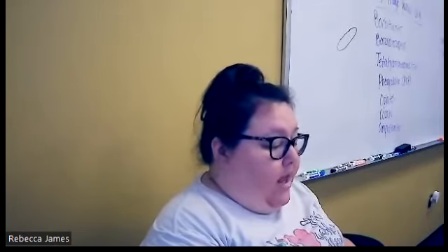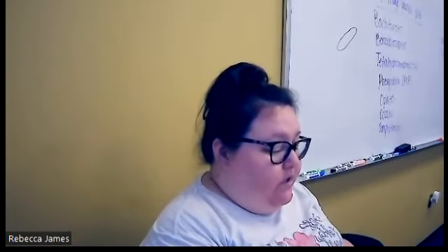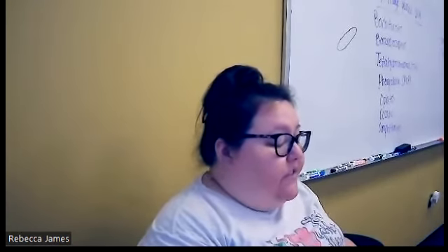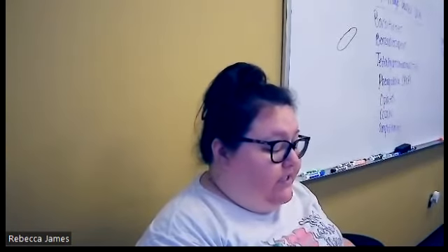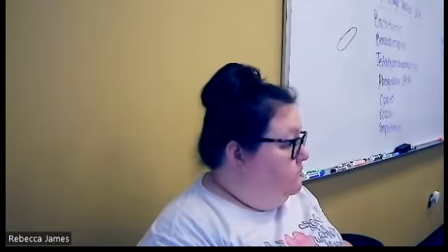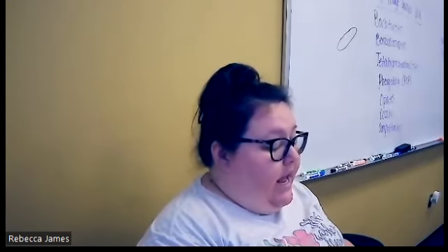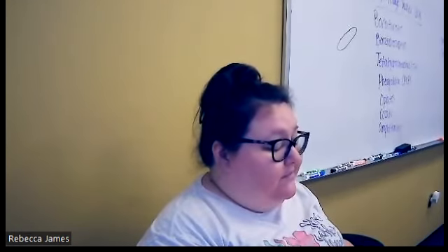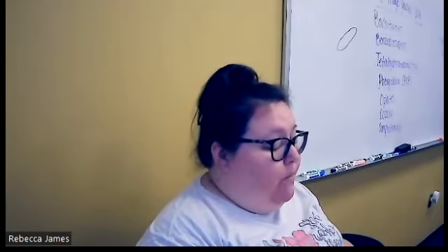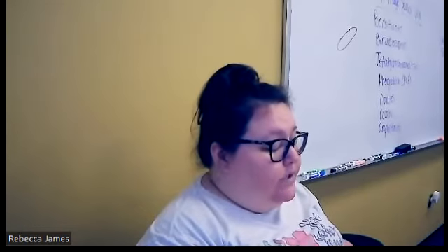So, how you determine these three. Out of the schistosomas, Schistosoma japonicum is the only round one, and it has like the middle part, and then the outer part is smooth, kind of. It's round.